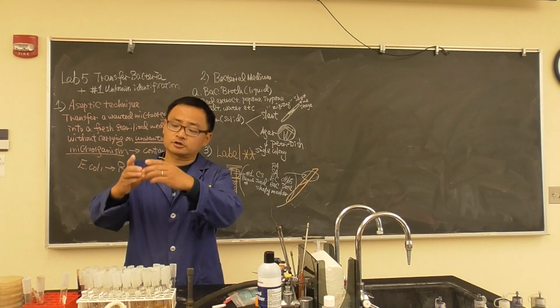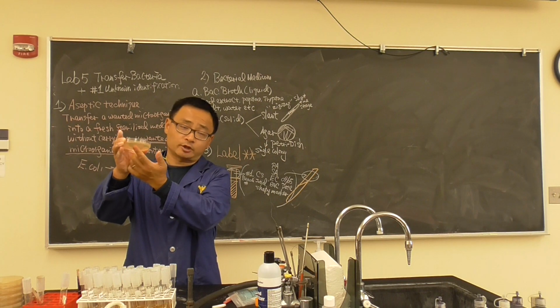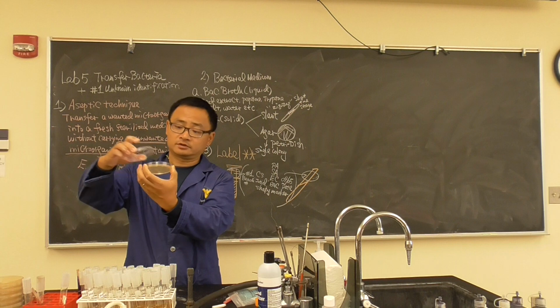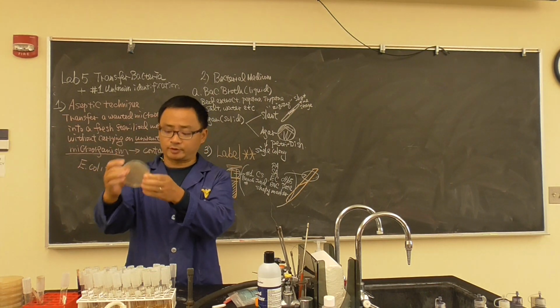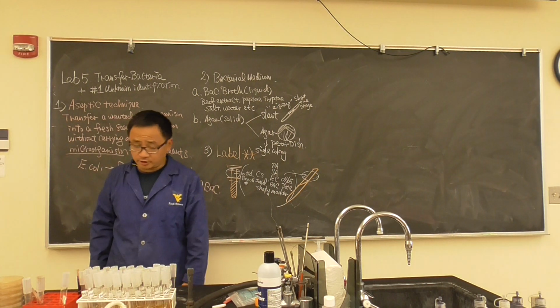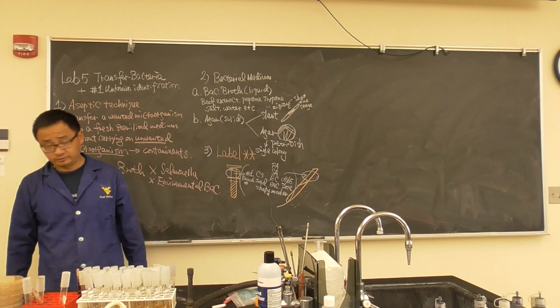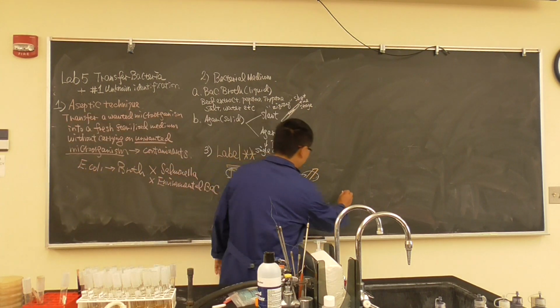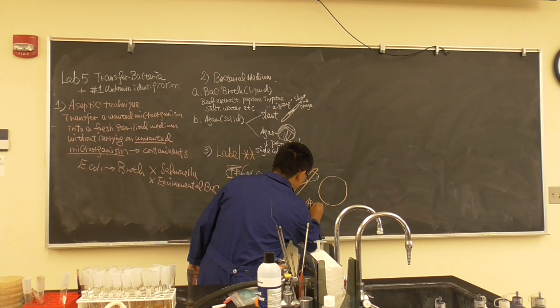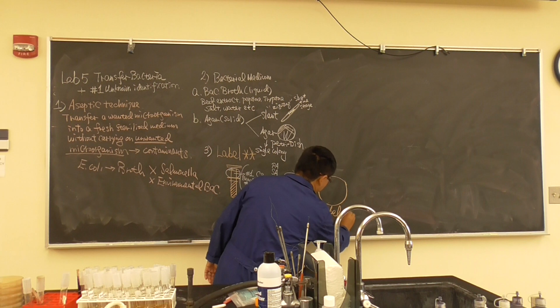Sometimes people can also label at the edge, but make sure this edge is at the bottom. The same thing: don't label the lid at the edge. So most of the time we label at the bottom. This is a very simple true or false question in the exam. Lots of people know, but in practical life, they label at the lid. So always remember, if you have an agar, label the bottom.